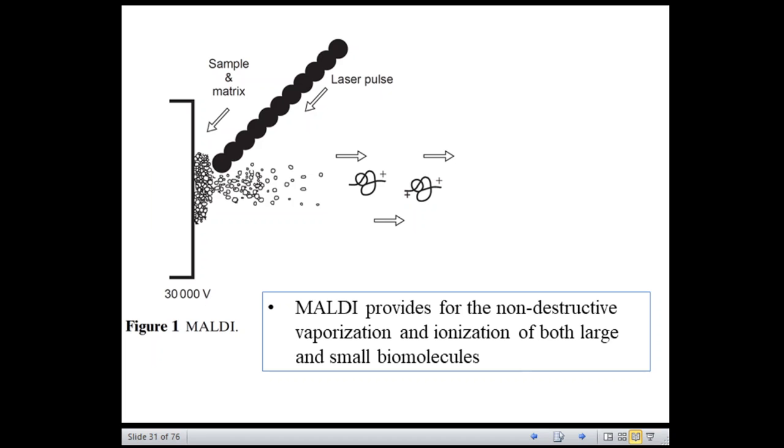As you can see in the figure, there is a laser pulse, and then we have the sample and the matrix mixture, and you can see the analyte which is intact.